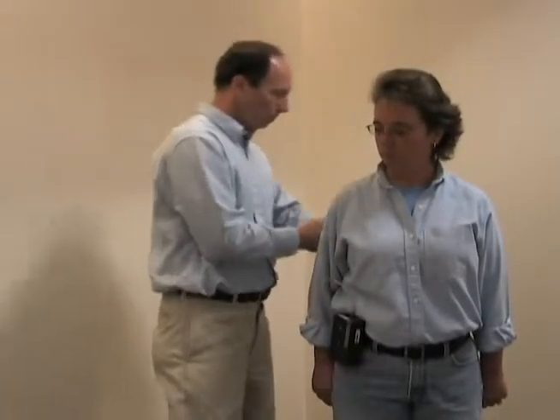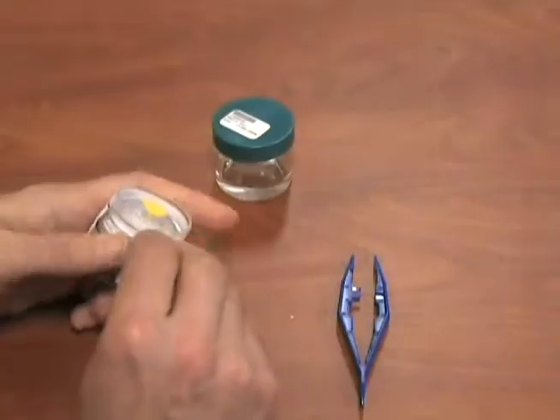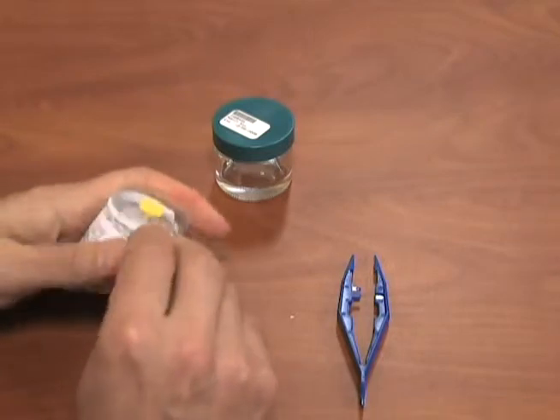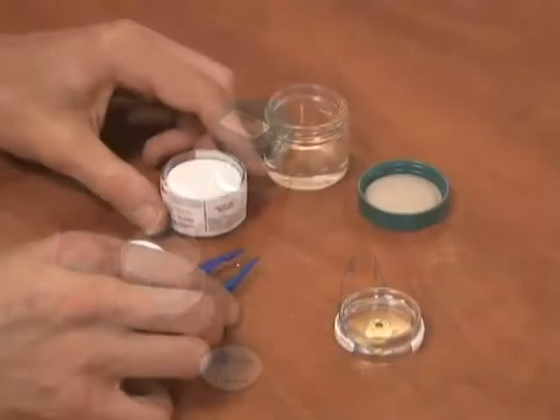Remove the equipment and return to the area where you performed the pre-calibration to perform post-calibration and prepare your sample for shipment. Remove the top section of the cassette using a cassette opener or screwdriver.